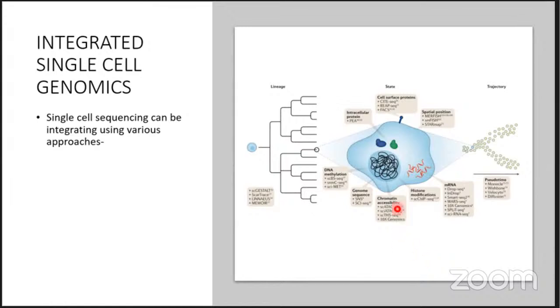As we can see, the data is from single cells, but from one sample itself we are typing thousands and millions of cells, and from each cell a lot of huge data comes out. So the integration of each and every data type is a challenge, but over time, many more analysis pipelines are coming out.